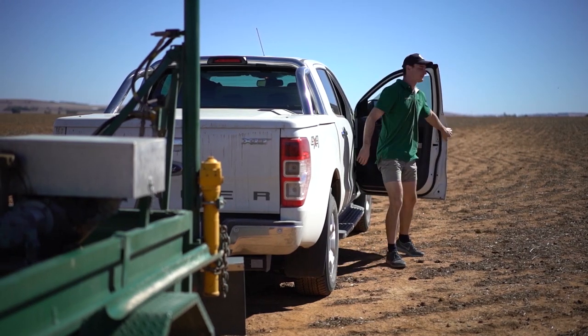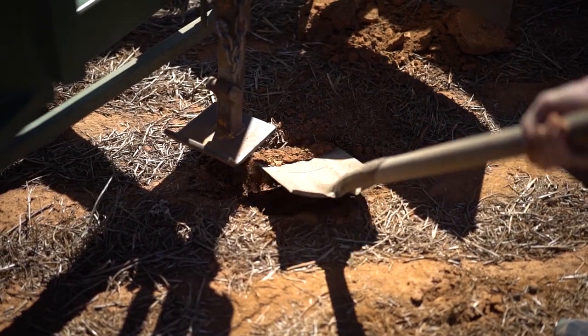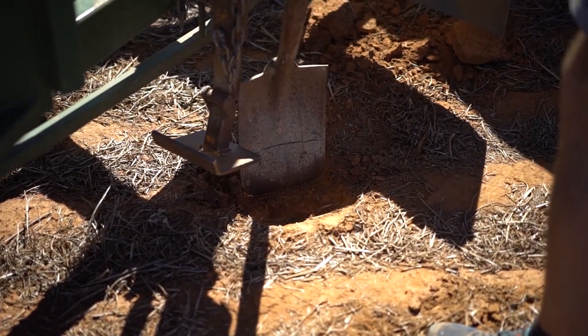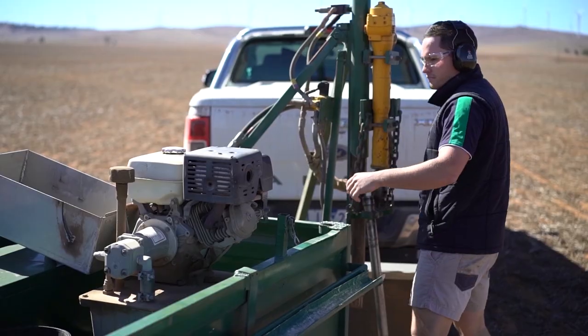When we get to the soil sample location, what we're doing is we're removing 10 centimetres of topsoil. What can generally happen if you don't do that is the 0 to 10 sample can be drawn down to the deeper parts in the segments, so it can be misrepresentative.